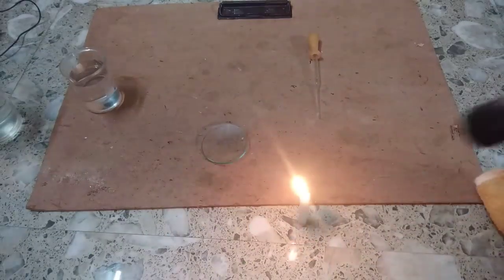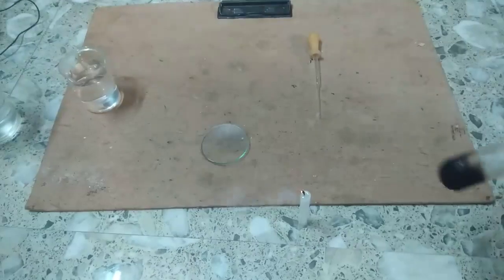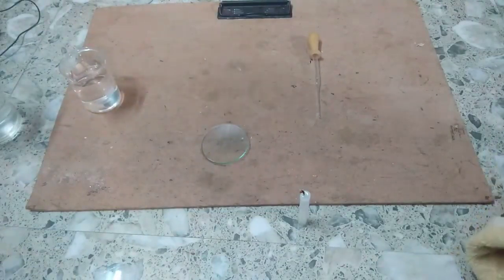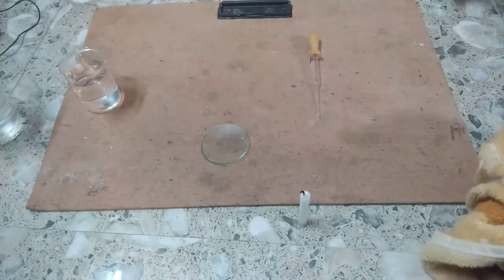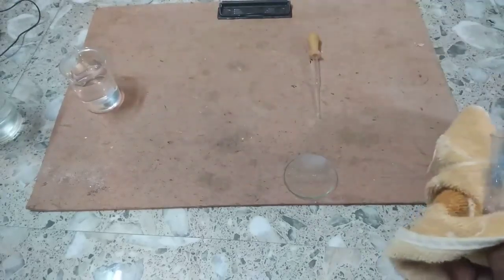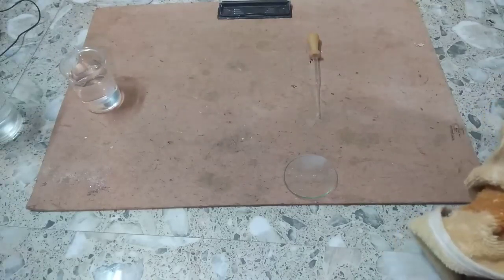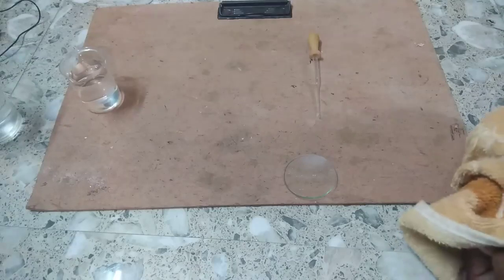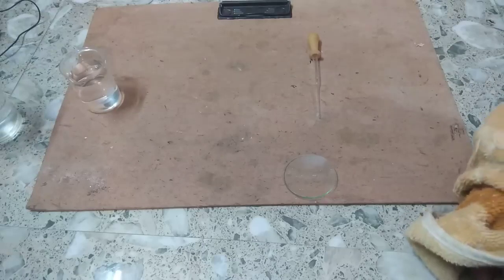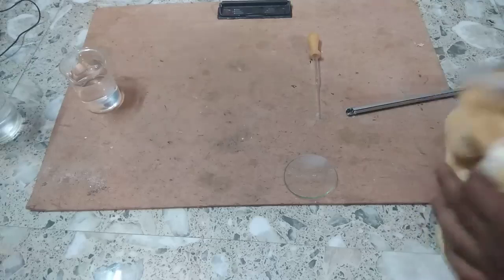Now I will take out this heated copper sulfate and see what happens. We are taking this copper sulfate in the watch glass and let's see what is the color of this copper sulfate.